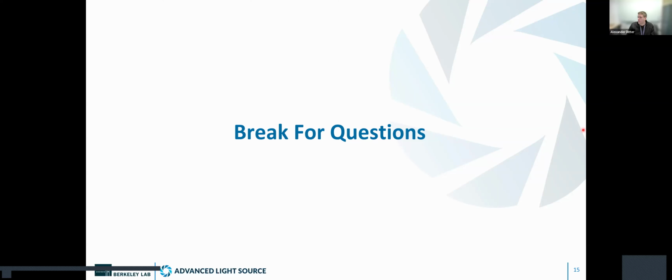We haven't had any users who have wanted to look at sodium specifically. I'd have to look at the literature to see what the edge actually tells you, because I'm really not familiar with it. But I think this is right in the middle of our energy range. It would be a great one for us to measure. But so far, at least for the year or so that I've been here, we haven't really had anyone trying to do this yet.